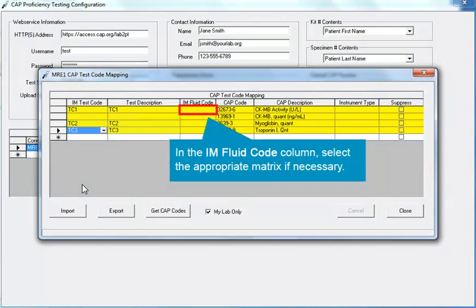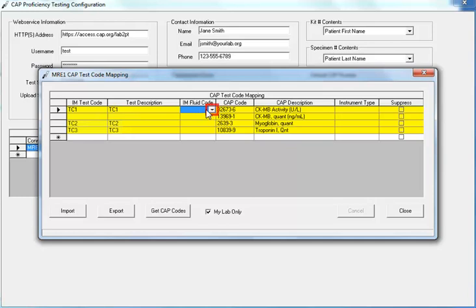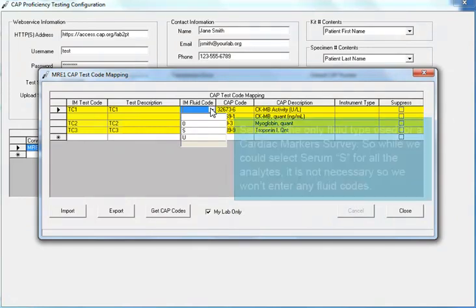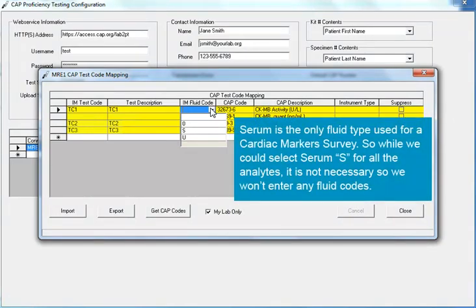In the IM Fluid Code column, select the appropriate matrix if necessary. In this case, the instrument uses O for Other, S for Serum, and U for Urine. If you report on only a single fluid type, then you do not have to define a fluid code. If you report on more than one fluid type, you have to define all appropriate fluid types for that analyte. Serum is the only fluid type used for a cardiac marker survey, so while we could select Serum S for all the analytes, it is not necessary, so we won't enter any fluid codes.